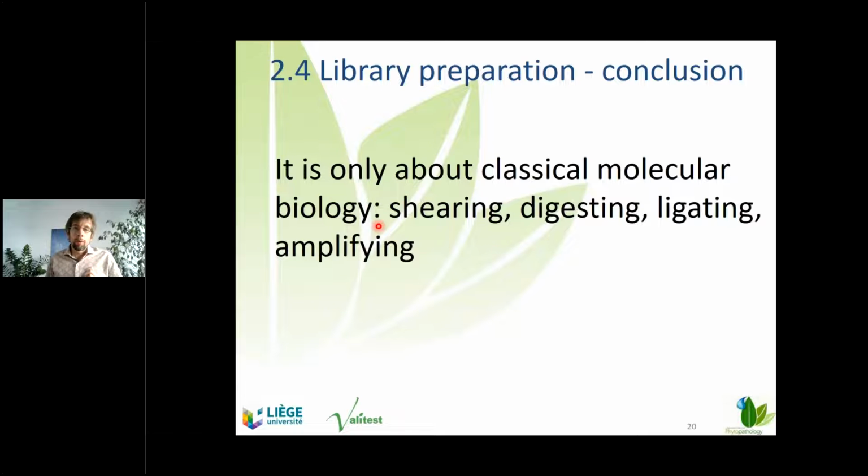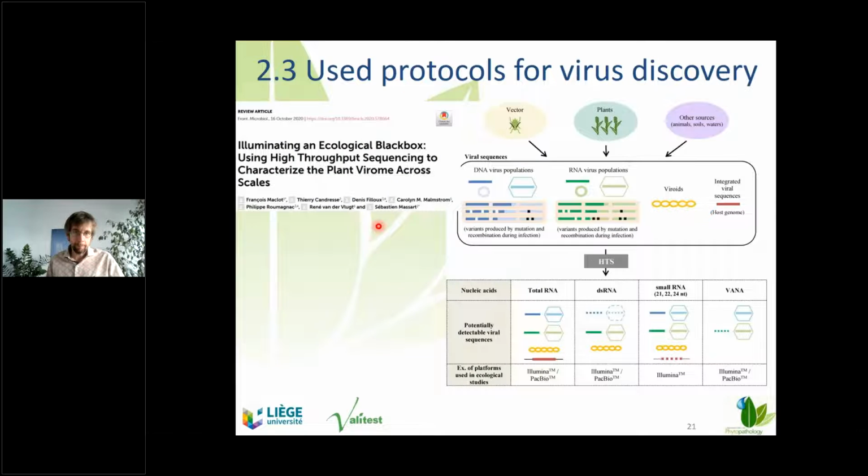So the key message on library preparation is that it is often quite a long process, but it's only classical molecular biology. You shear your DNA, you digest it, you ligate it, I mean, ligation of nucleic acid. You make amplification. It's really the basic steps of molecular biology. Nothing really particular there. To give you an example of a protocol that can be used for viruses, again, there will be other examples on insects or bacteria later on.